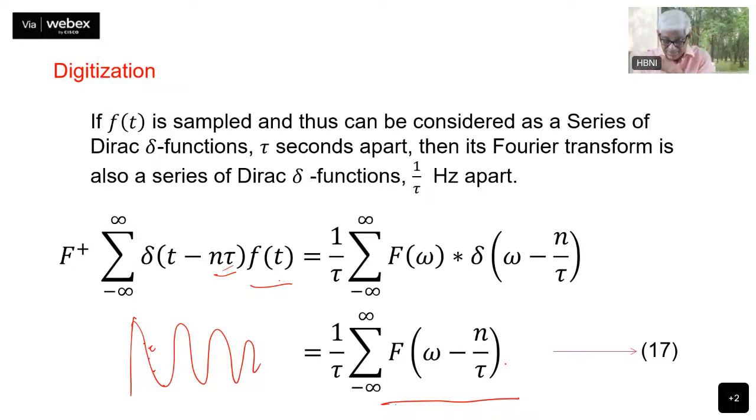When you look at this, n is equal to 0, n is equal to -1, n is equal to +1, -2, +2. So you get a whole range of spectral features. Of course, filters are used to eliminate those, to pick up only the one which is n equal to 0. However, certain components of n equal to 1 and -1 do show up in your spectrum, and that we will discuss when we talk about the folding of the spectrum.